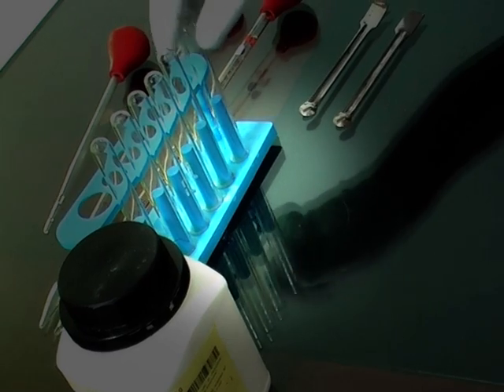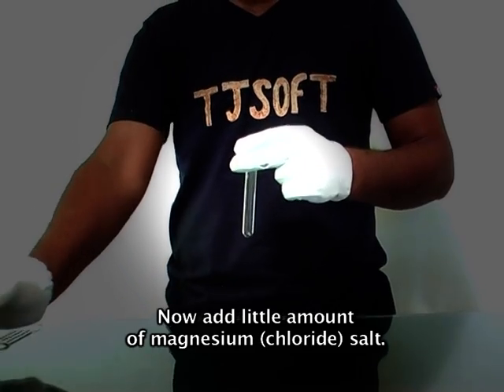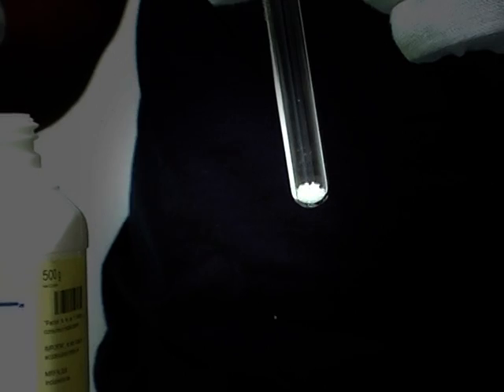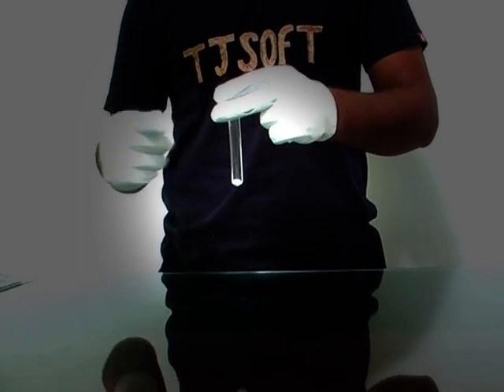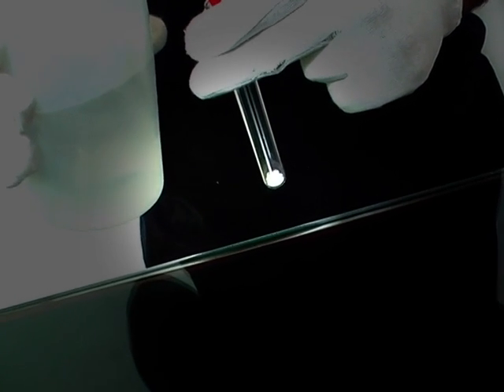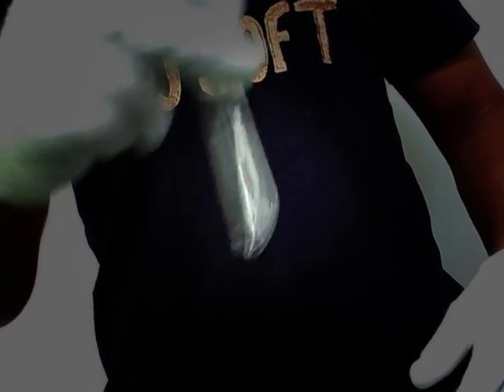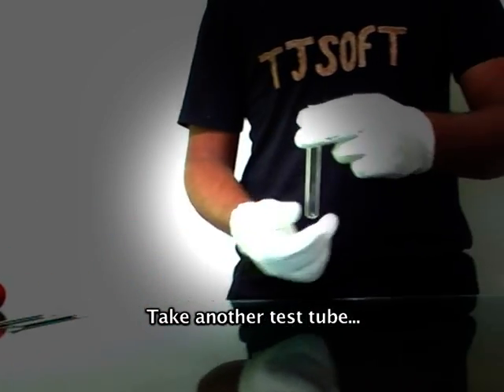Take a test tube. Now add a small amount of magnesium salt. Now add cold distilled water. Shake it well. This solution is called the original solution.